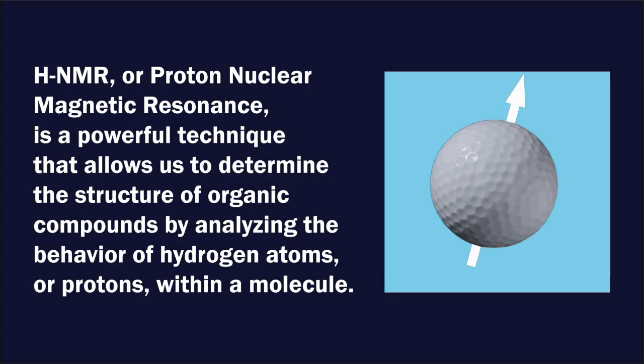So, what exactly is HNMR? HNMR, or proton nuclear magnetic resonance, is a powerful technique that allows us to determine the structure of organic compounds by analyzing the behavior of hydrogen atoms, or protons, within a molecule.